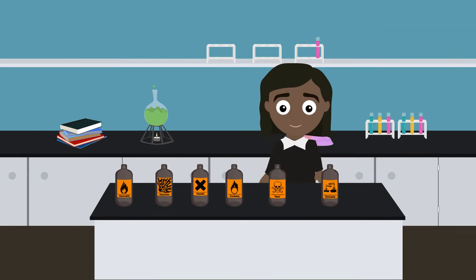There are more signs that people use but these are the ones you will find in your school laboratory. So keep a lookout and don't get too close.